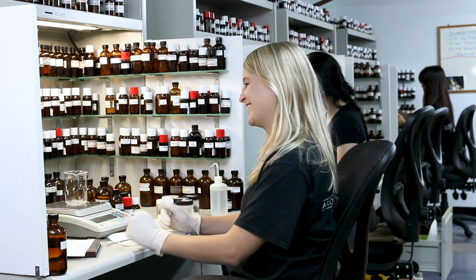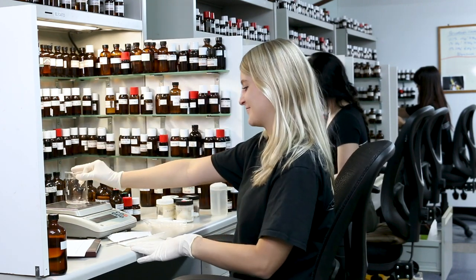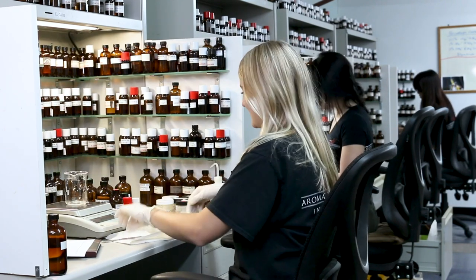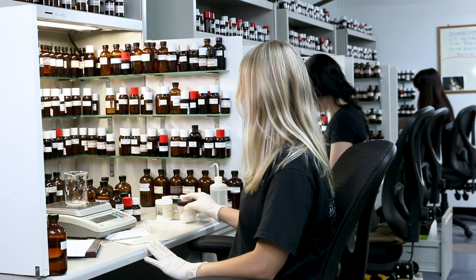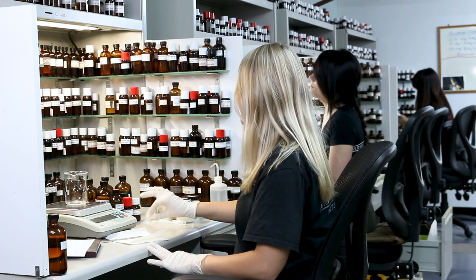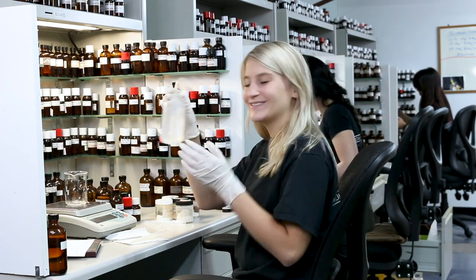It's Jada again! We will be using a beaker, a spatula, raw material, pipettes — a lot of them, since we can only use them once — and some alcohol to make sure everything is clean and sterile.